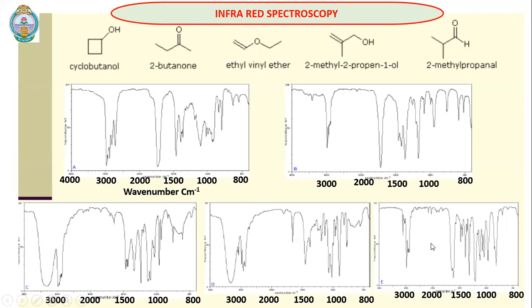So by looking at each and every functional group and its characteristic vibrations, we can clearly identify which molecule it is. For example, this vinyl ethyl ether has a double bond, so the CH vibrations will be more than 3000, right? 3000 will be somewhere here, so these are more than 3000. Sorry, this is 3000, so those less than 3000 are aliphatic CH vibrations. This sharp band is the alkene CH vibration. So that means we have both aliphatic and unsaturation.